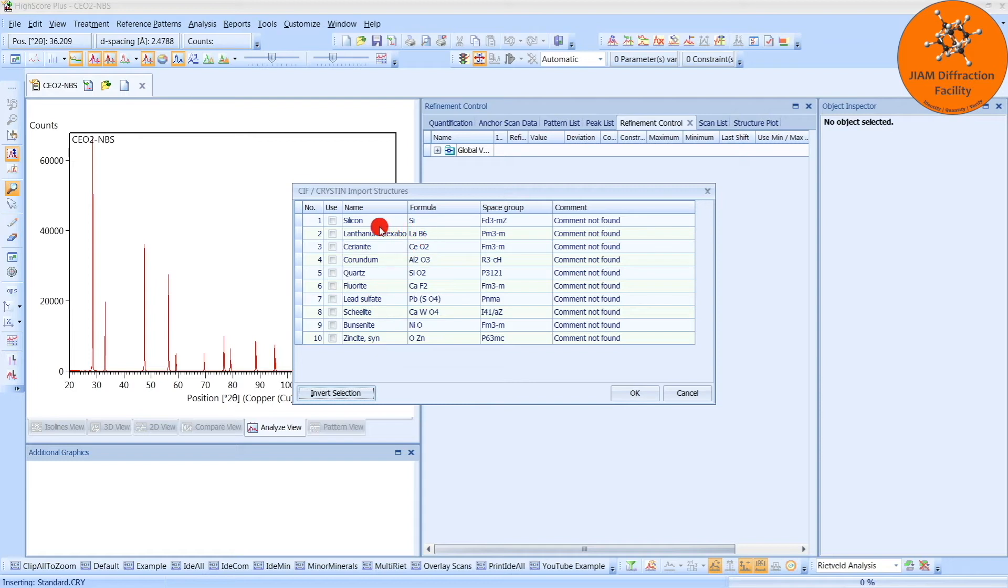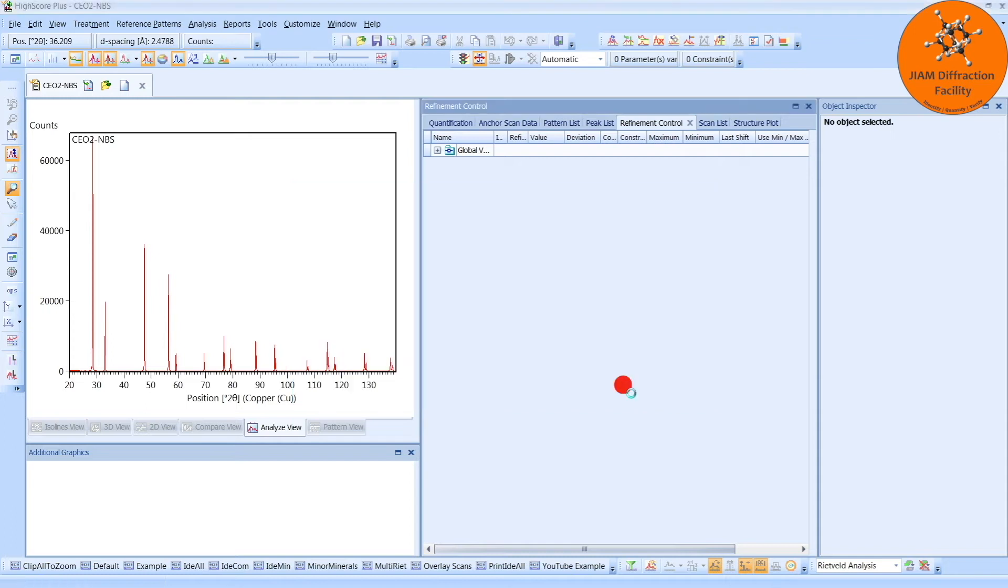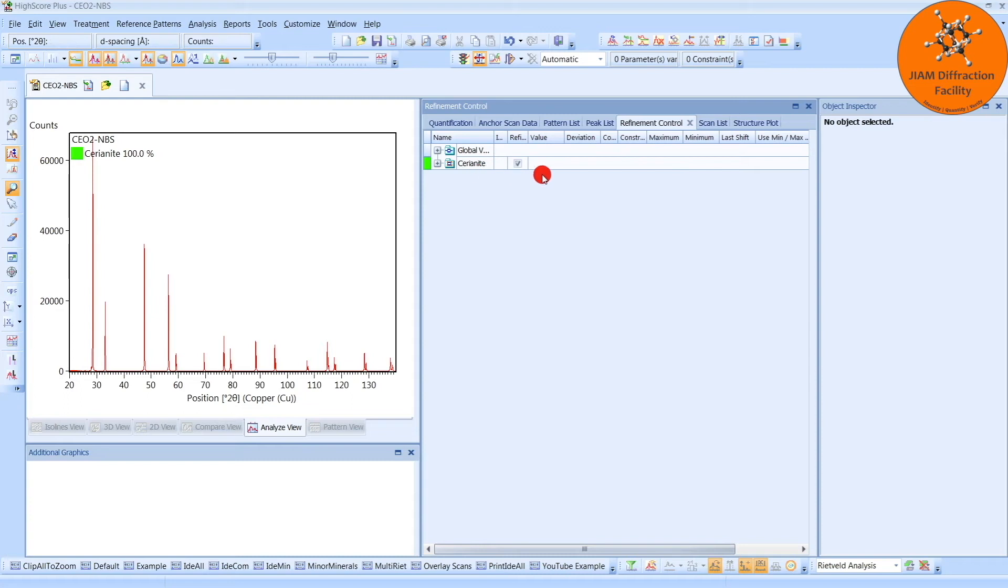Now, we have Cerium Oxide, so I will put a checkmark next to the three, OK, and now we see the phase here, and we see the phase here, which is under Refinement Control.